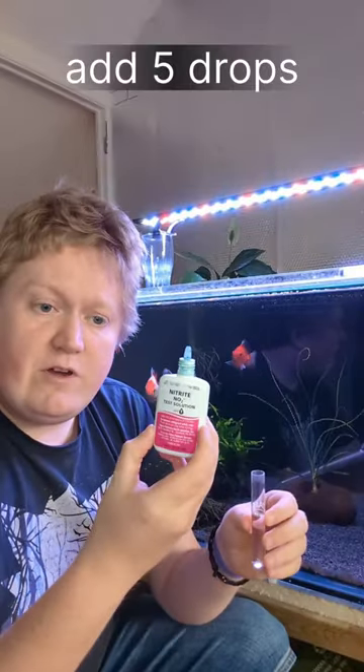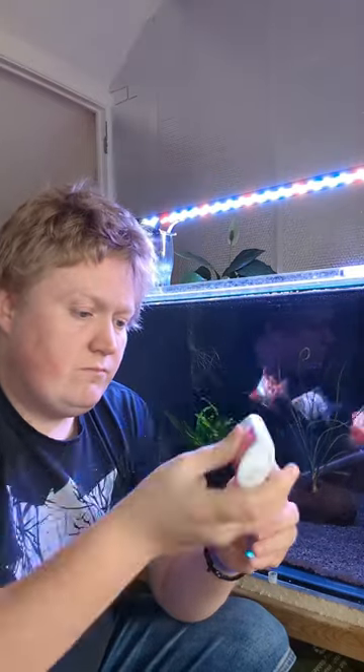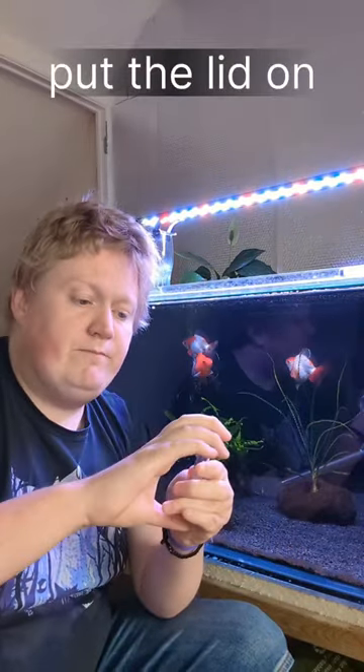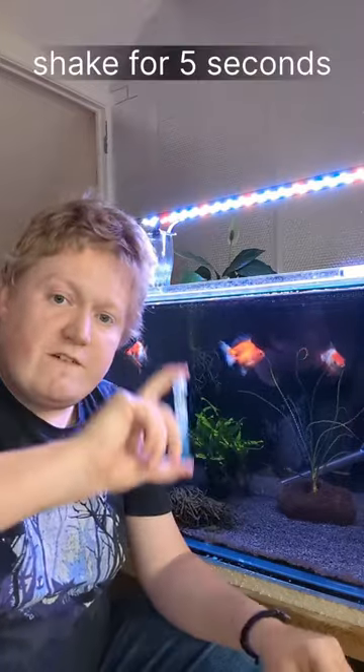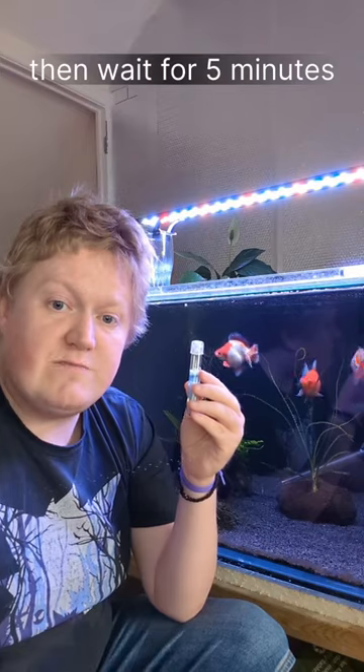Add five drops of the nitrite solution, put the lid on, shake for five seconds, then wait for five minutes.